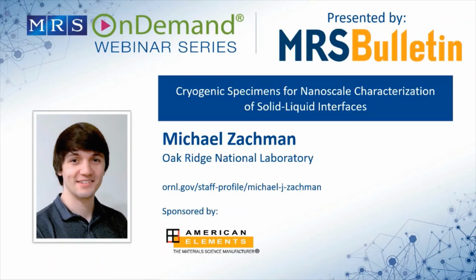So what you do is you start with your sample in a little nitrogen pot. You put the tip of the holder in there underneath of the nitrogen, and you put your sample into the tip and secure it, and then you slide this little shield over top. That's actually very difficult to do. That's where personal experience comes in too.